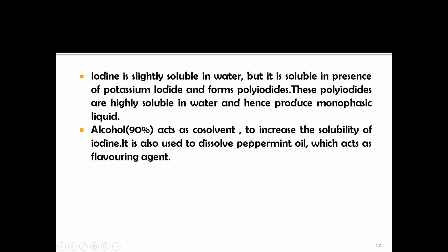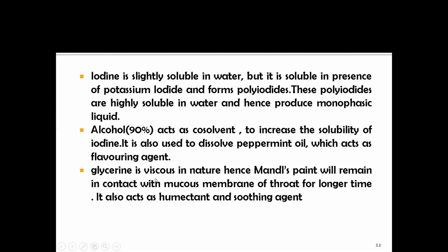Alcohol acts as a co-solvent to increase the solubility of the iodine, and it is also used to dissolve the peppermint oil, which acts as a flavoring agent. Glycerin is used to increase the viscosity of the preparation and also acts as a humectant and soothing agent.